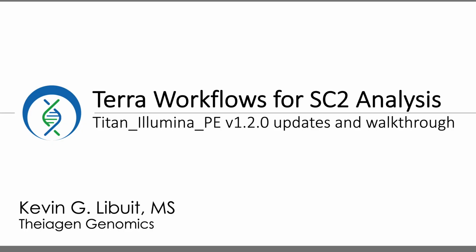All right, welcome everyone. My name is Kevin Libuit, and I'm here to talk to you about the most recent release of the Titan Illumina paired end workflow, version 1.2.0. In this video, I'm going to cover the highlights of this most recent release, and then afterwards, I'm going to provide a walkthrough of how to set up your Terra workspace to start using this updated version.